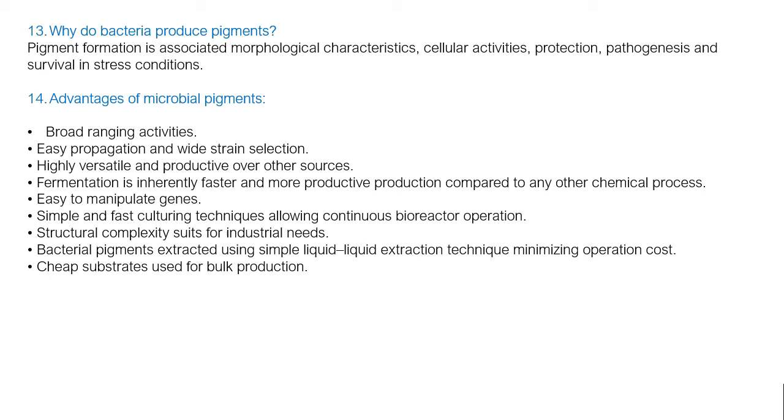Then bacterial pigments extracted using simple liquid-liquid extraction techniques. It minimizes the operation cost also. And cheap substrates used for bulk production. Okay, so these are the reasons why microbial pigments are nowadays used widely.